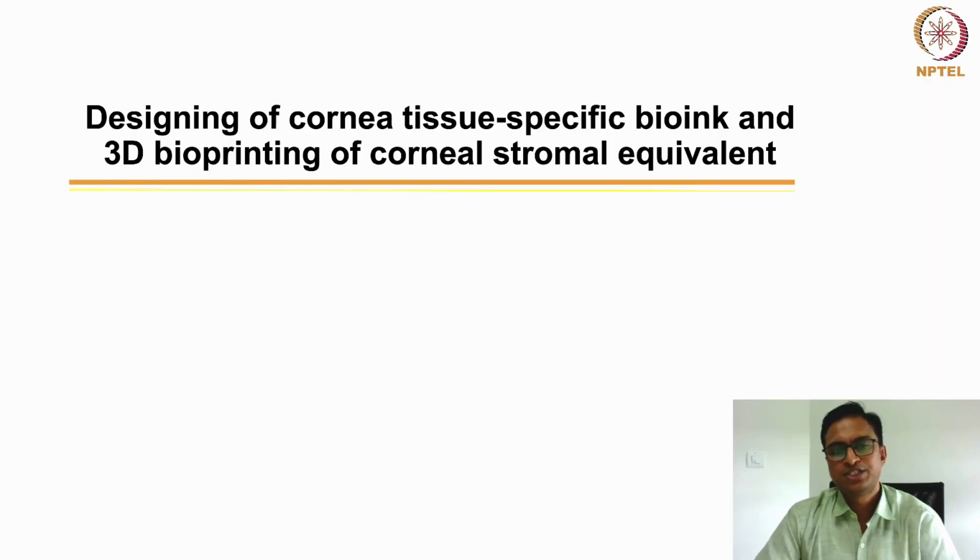So in this lecture, we'll discuss how to design a cornea tissue specific bioink and how a corneal stromal equivalent can be developed by using 3D bioprinting technique. This is mostly our research work done from our laboratory in collaboration with LV Prasad Eye Hospital and also scientists from the Center for Cellular and Molecular Biology. So this is a collaborative work done by our group.